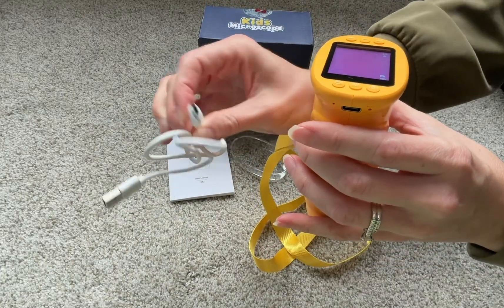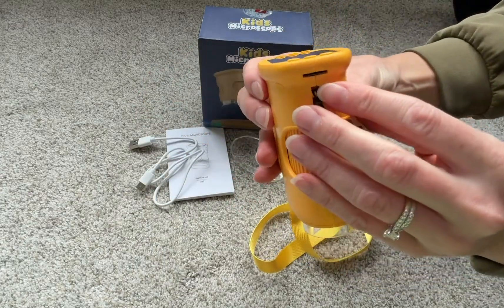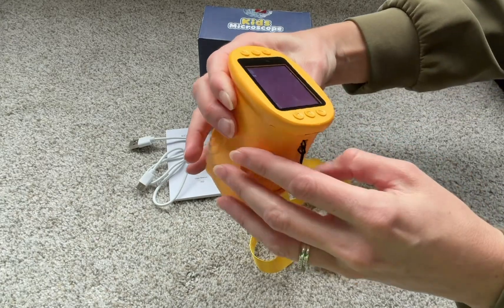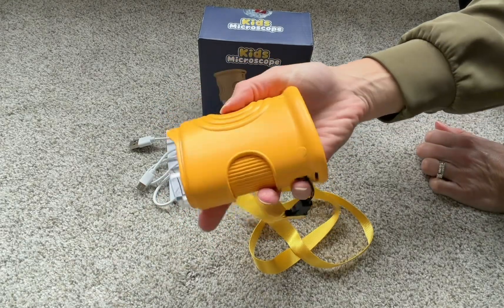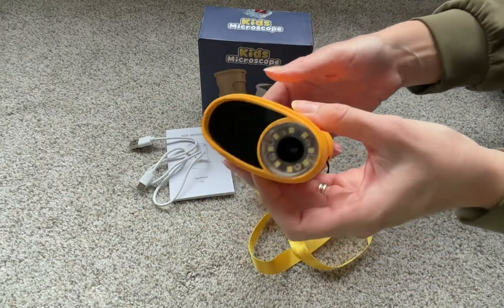This is how you charge the device. You will need a brick to plug it into the wall. On this side, there is a spot for a micro SD card — this is great to store all those photos and videos and get more storage. It's a really nice portable kids' microscope to start out and look at everything in nature. Check this one out this holiday season.